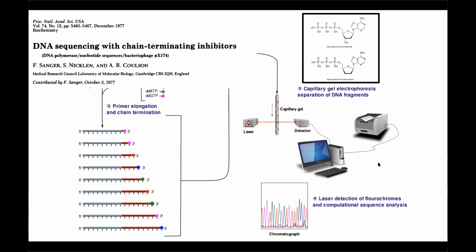Another question is, without initially knowing a viral sequence for an RNA strand, how do you determine the primer sequences? Good question, you don't. What you do with next generation sequencing is you actually just shear DNA and then you ligate known adapters to it, so it can sequence anything.